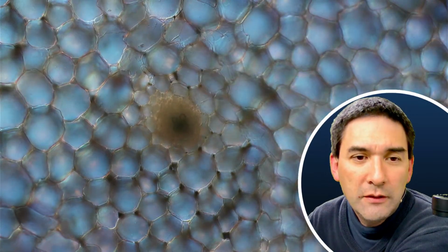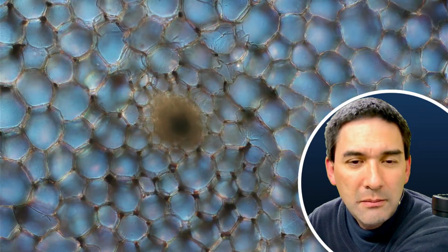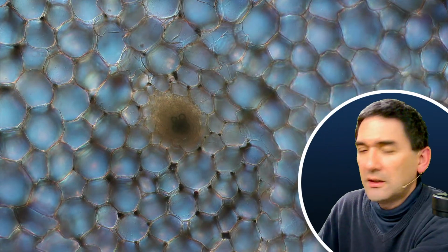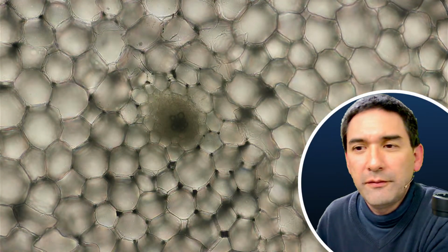But actually, look, if I focus here, maybe 2 cell layers thick. Maybe I got it 2 cell layers thick. So it's quite okay, I think. This is now bright field. That's basically bright field.